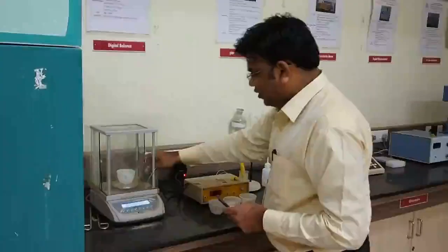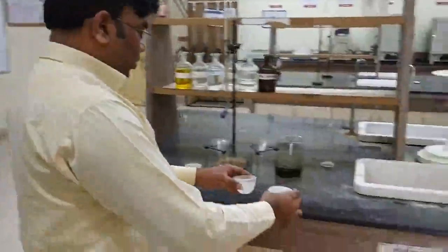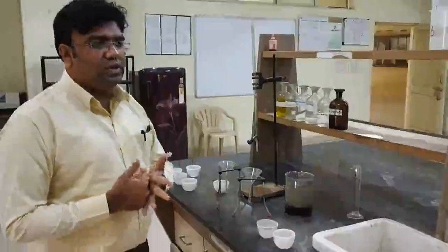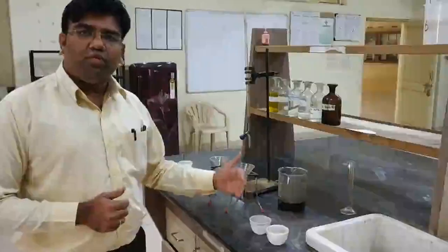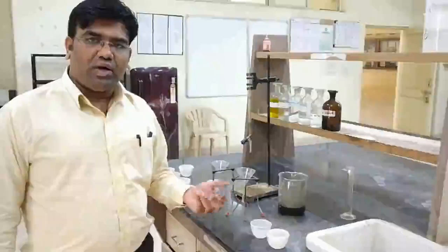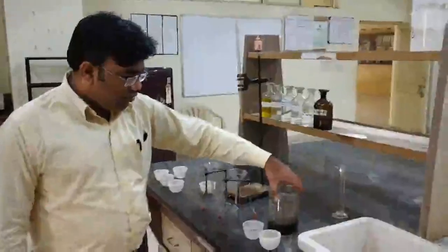Now the next step is to put the sample in it, right? We are going to start with crucibles A and B, which we are going to use for the determination of the total solids. What has been given in the manual, or what we had in the discussion, was that we will have to put some sample into it and we will be evaporating that sample. We will be evaporating the water from it, and the remaining part will be the solids, right? So we are going to put these samples into these crucibles.